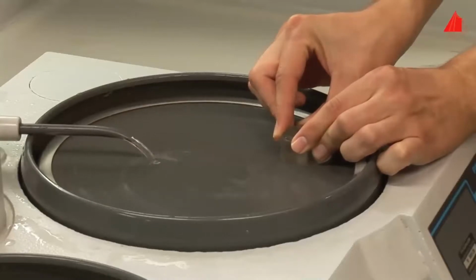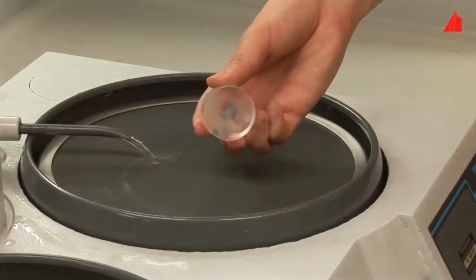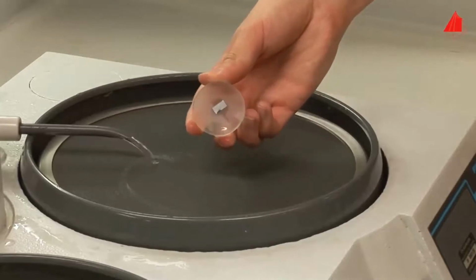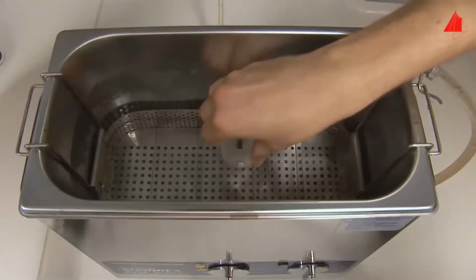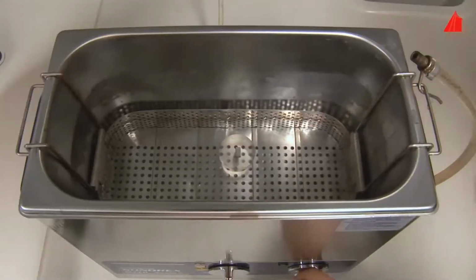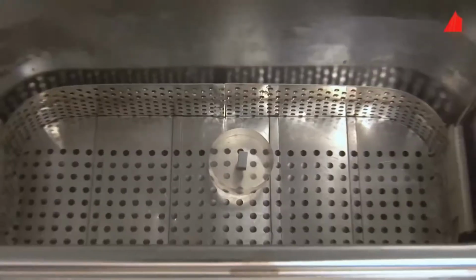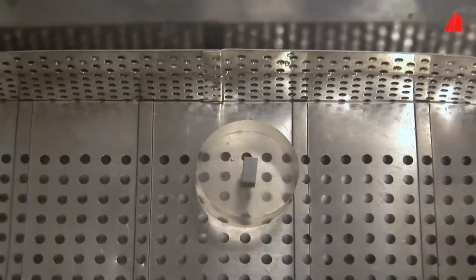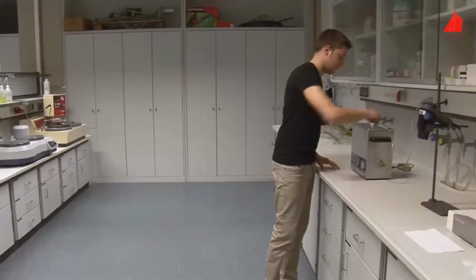Grinding continues with 600 grit and 1000 grit abrasive paper until an immaculate, finely ground specimen has been achieved. The specimen is now ready for polishing. An absolute prerequisite for polishing is a thoroughly clean specimen. The ultrasonic bath and running water help to remove any residue from the ground surface. Otherwise, hard particles might be pressed into the polishing cloth and scratch the surface.